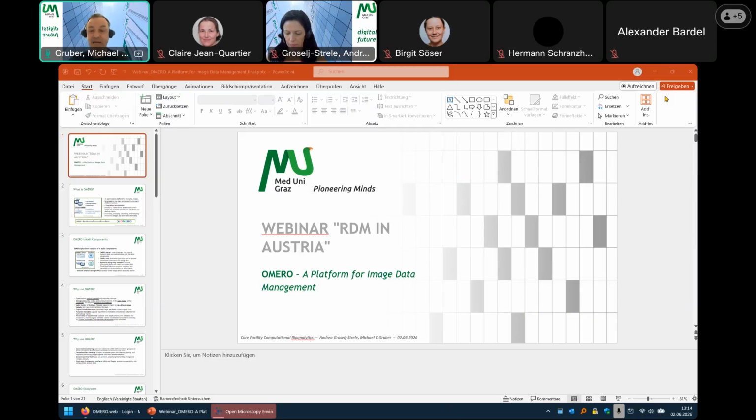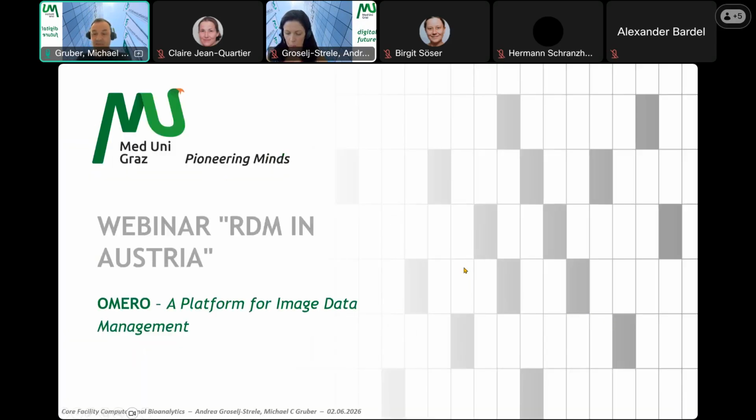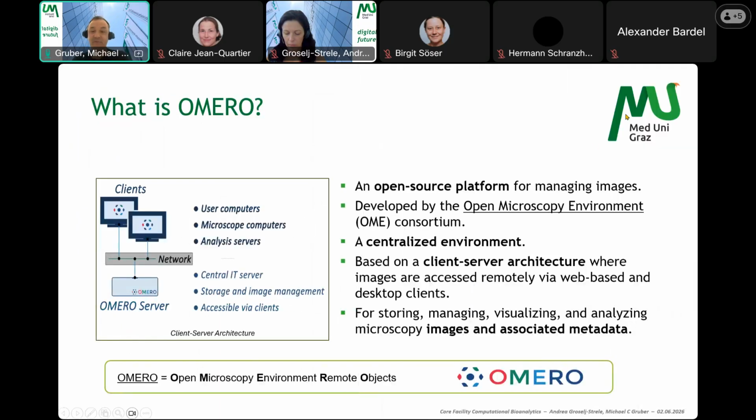In my part of the presentation, I'm going to give you an overview of OMERO and a short introduction. I also want to add a short remark that this presentation is full of many links, which you may find useful if you want to dive deeper into this topic, OMERO. So let's start with the question, what is OMERO?